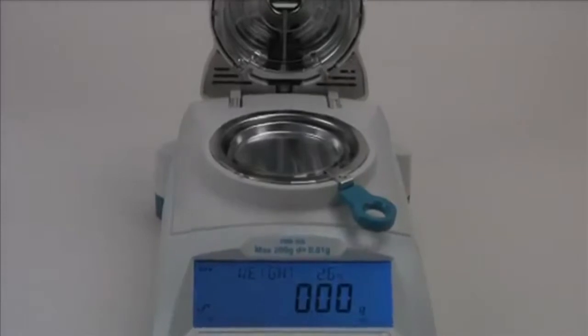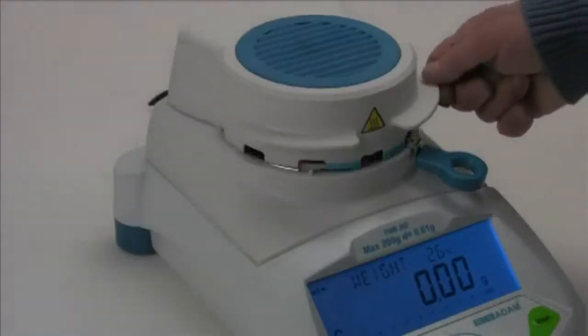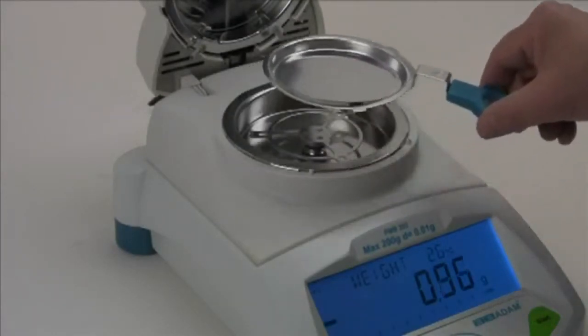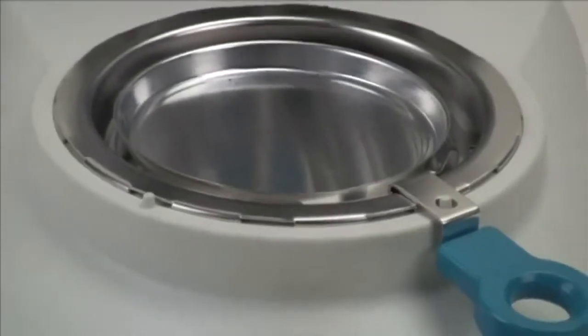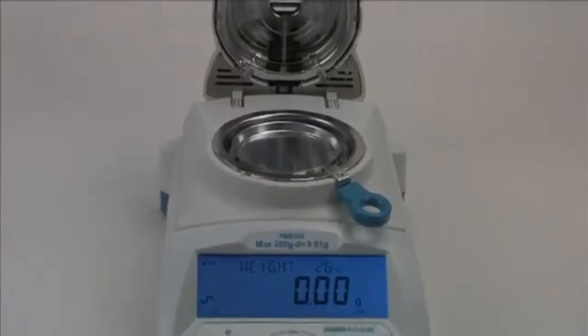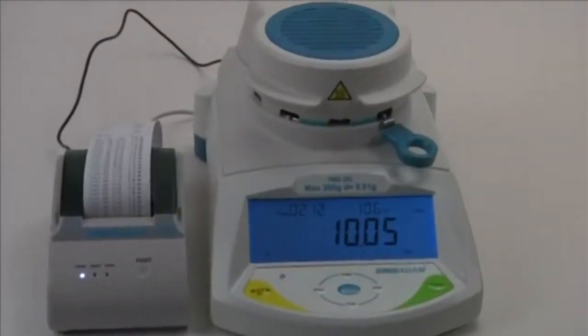Two Adam moisture analyzers offer the same features in operation for simple and fast moisture determination. The PMB 53 provides moisture content results to 0.01% with a maximum capacity of 50 grams. The PMB 202 delivers moisture content results to 0.05% with a maximum capacity of 200 grams.